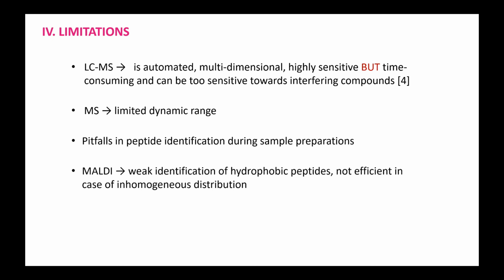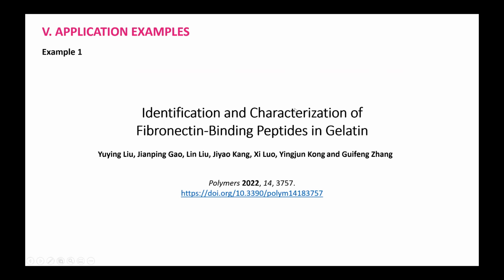In MALDI, it was seen that there is weak identification of hydrophobic peptides, and it was inefficient in case of inhomogeneous distribution. And for the electrospray ionization technique, it was observed that it was very sensitive to modest amounts of impurities.